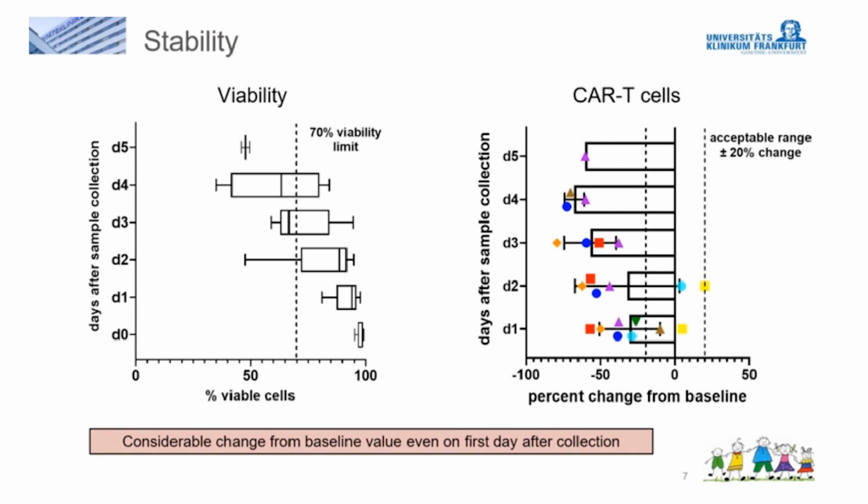Normally, our acceptance criteria is much tougher. For accreditation reasons, we would not measure a blood sample older than 48 hours. After 24 hours, we no longer use activation markers in our laboratory because we know that this is strongly influenced by the age of the sample.